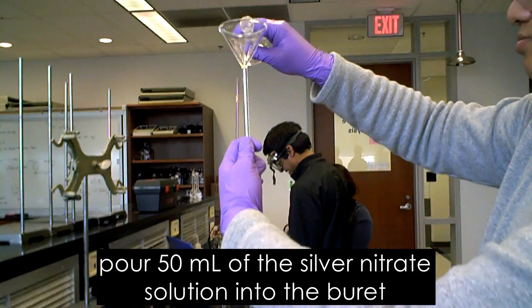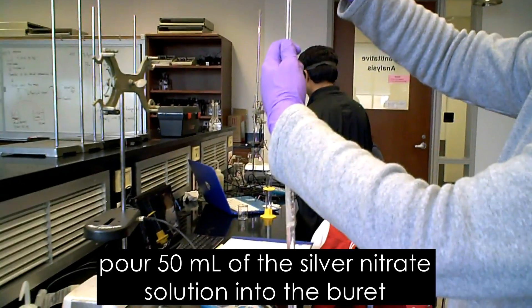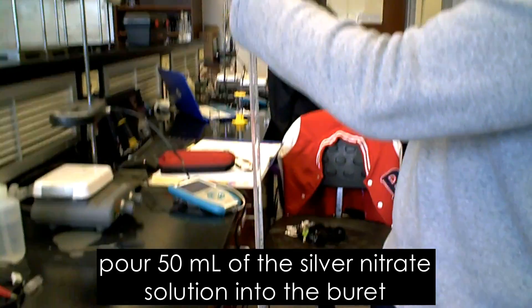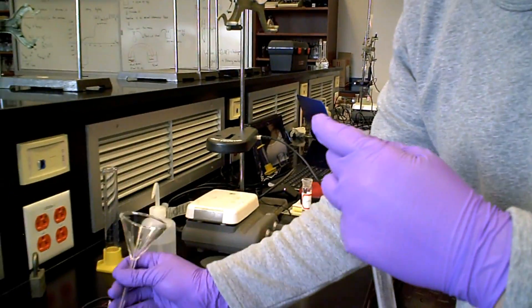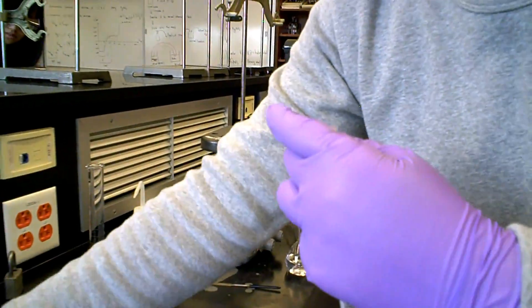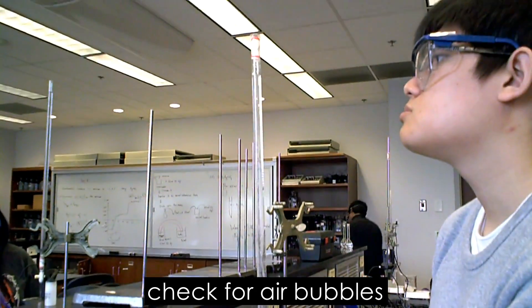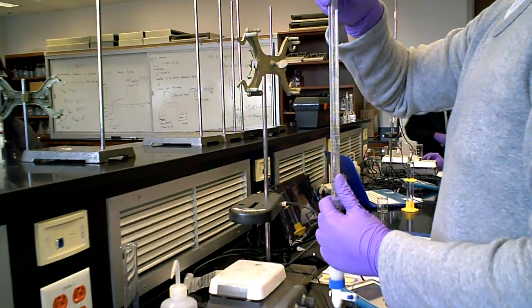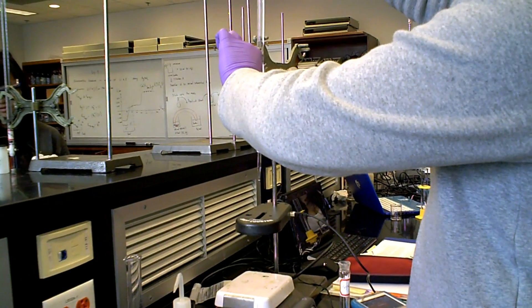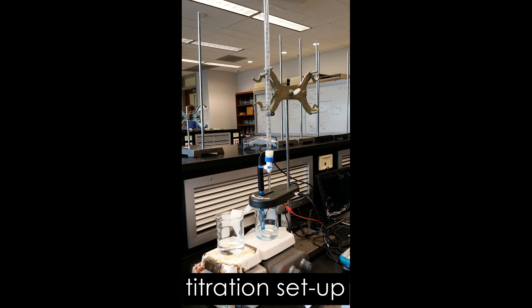Use a funnel to help pour silver nitrate solution into a 50 milliliter burette. Before starting the titration, be sure to check for air bubbles. Also remember to calibrate the drop counter, pH probe, and voltage probe.